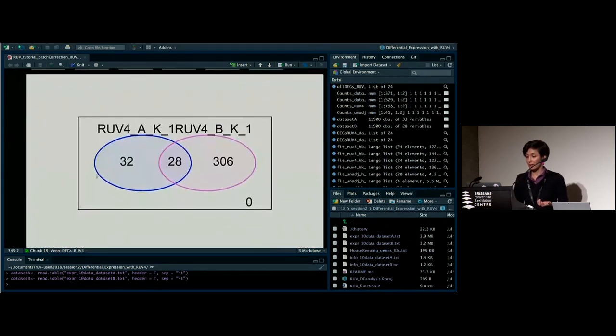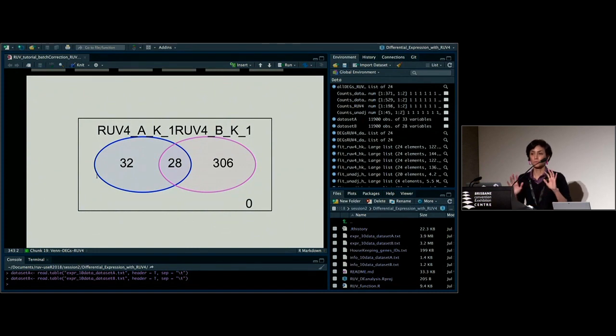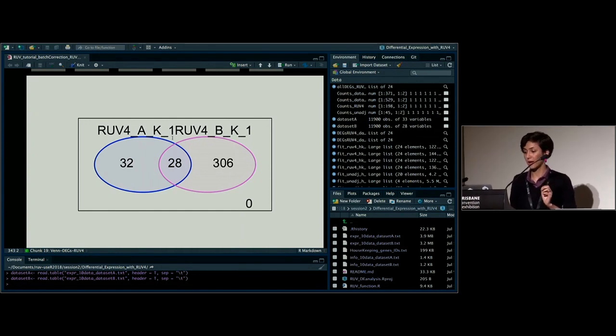And this is also again showing me something that the correlation plot showed me, the correlation between the log fold changes, because as I change the K value, for example, from 1 to 2 to 3, the number of differentially expressed genes that I get is different with different number of overlaps, and so it really matters which value of K we go with.